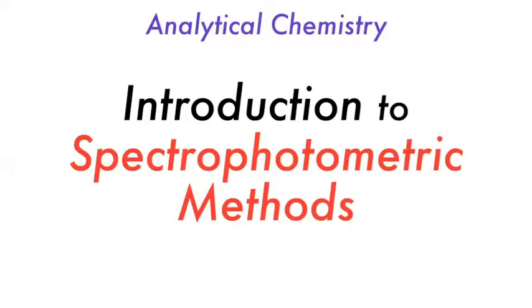Good morning, everyone. Welcome to the start of this next section where we're going to be talking about spectrophotometric methods. So these are going to be looking at some of the specific ways in which we can measure analytical signals. We can look at how we can use some of the information that we've learned throughout this course and actually analyze systems based on their interaction with light predominantly.